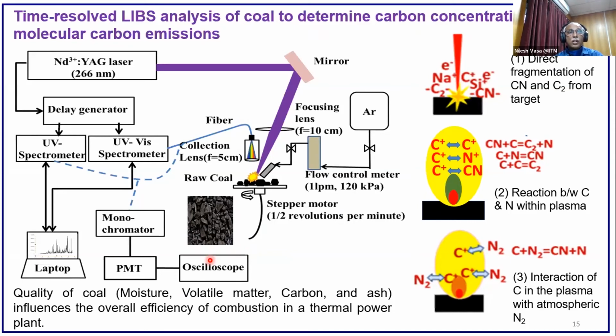This is somewhat related to how we can carry forward our laser ablation LIBS approach towards online coal characterization. Certainly, many attempts have been made to ablate coal and measure certain species related to sulfur elements or carbon, etc. And sometimes researchers have also attempted to determine the fly ash related elements using such a LIBS approach.